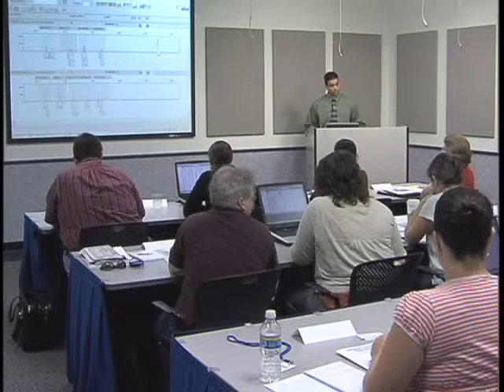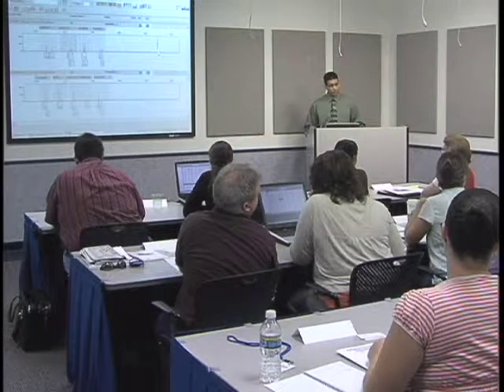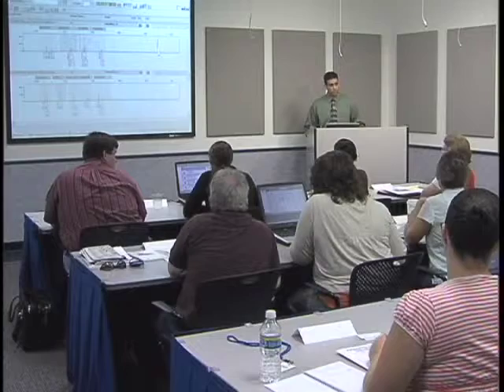What amount of your amplicon are you adding in the original run? For your original data, what's your volume there? It's just a regular 1 microliter. Okay. Because if you add all, I showed you that yesterday, it totally suppresses everything. So you can't even do a comparative, even 10 microliters to 10 microliters, because it just will suppress the size standard and everything ends up getting suppressed.